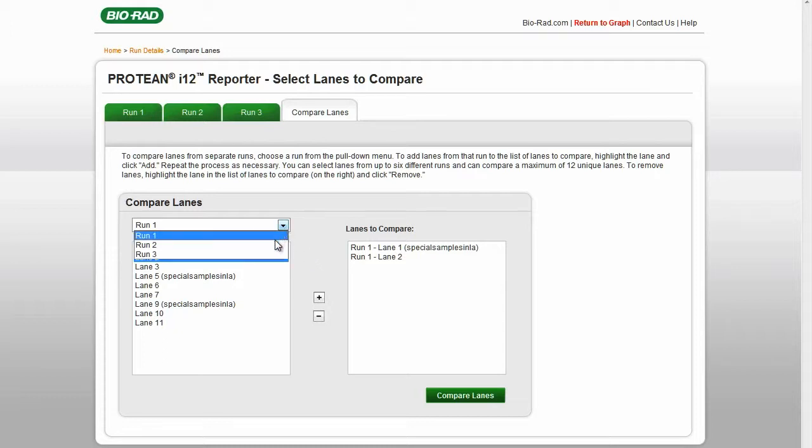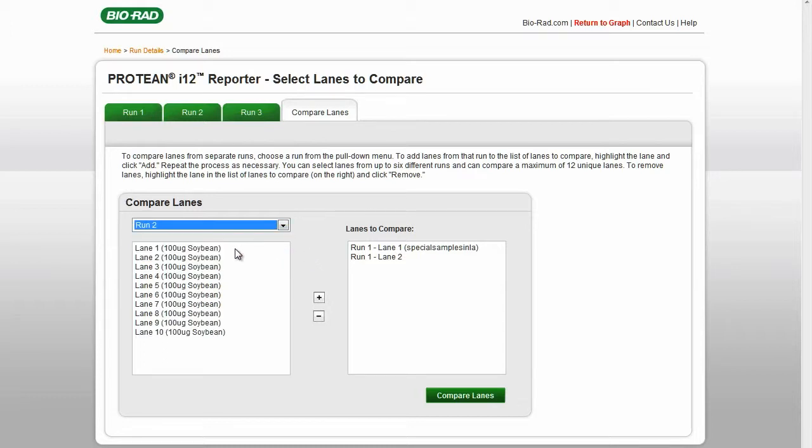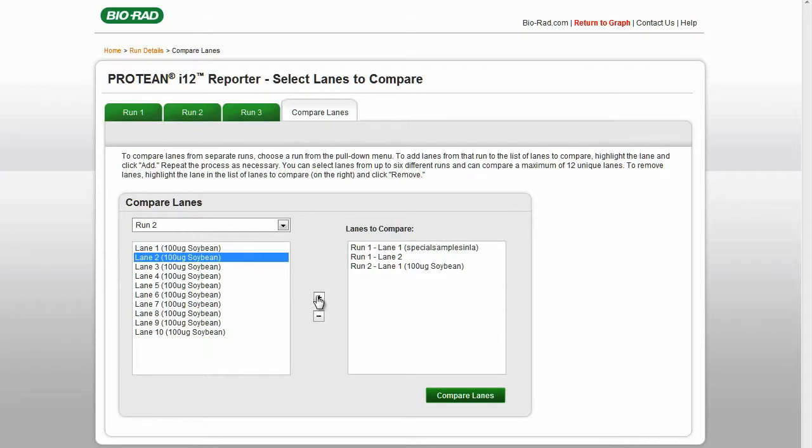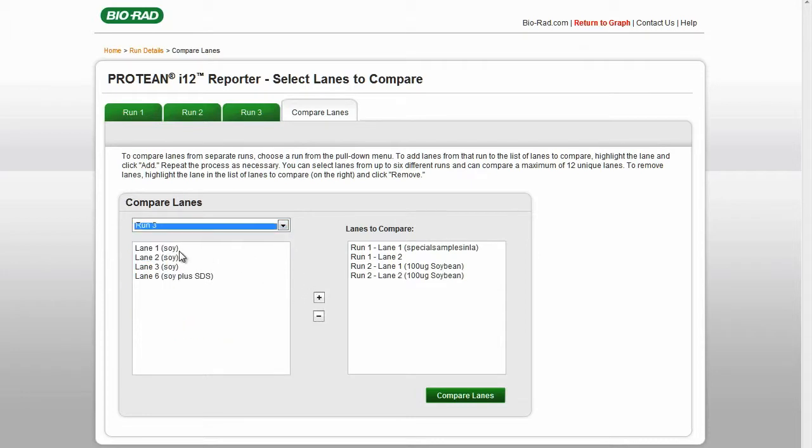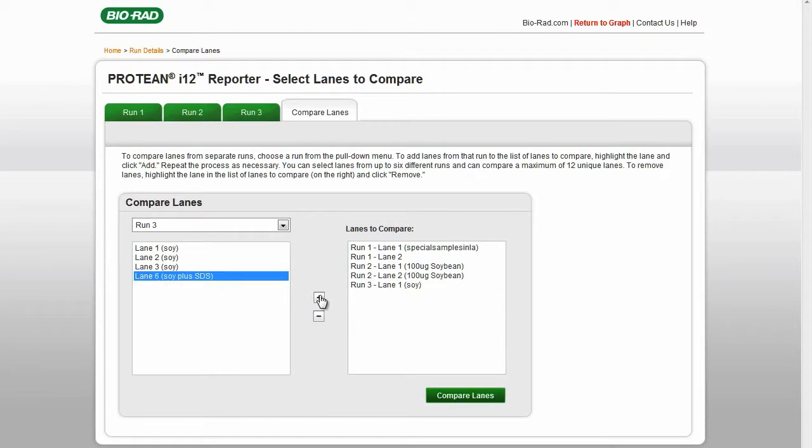Repeat the process by selecting the next run from the pull-down menu and selecting the lanes. When you are satisfied with the lane choices, click the Compare Lanes button.